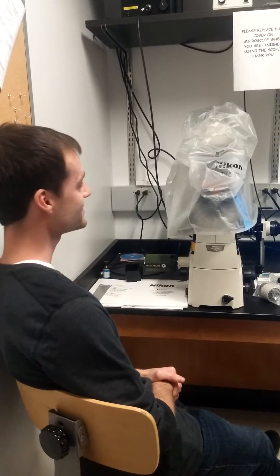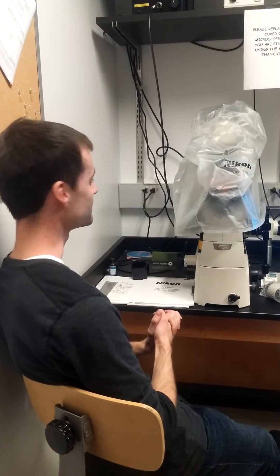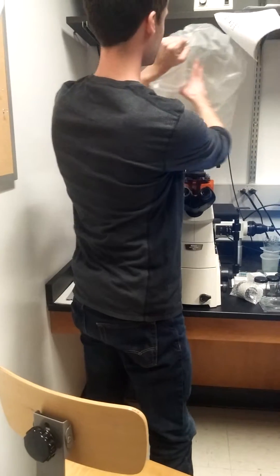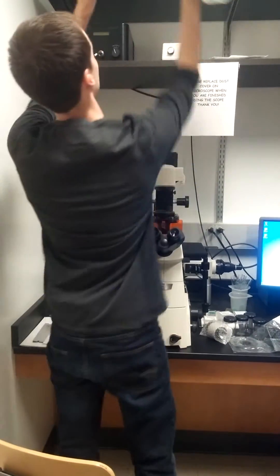Today we're going to be learning how to use the inverted fluorescence microscope. First thing to do is remove the dust cover. Carefully lift that off and set it aside.